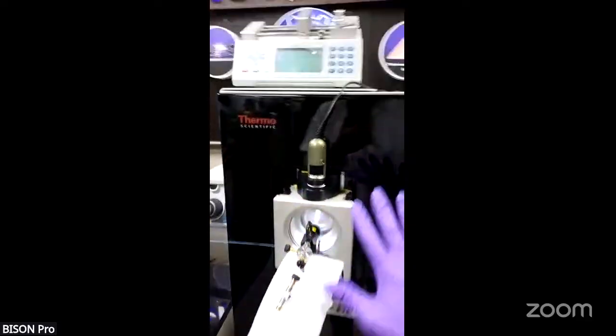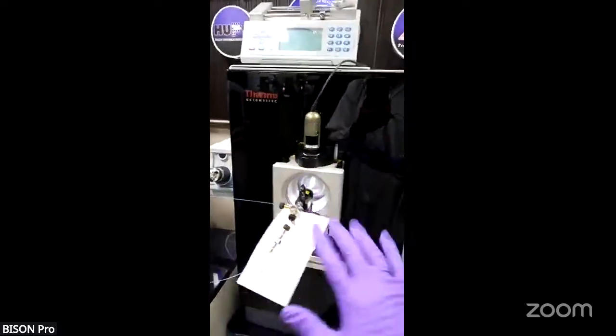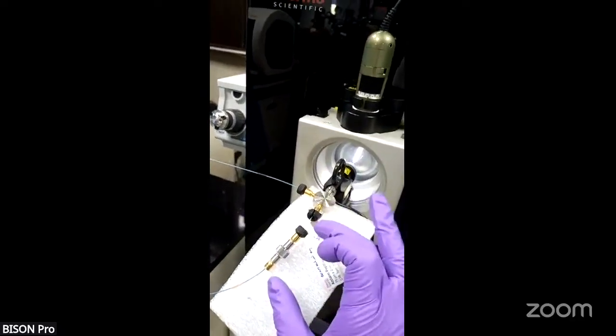This is basically the ion source of the Orbitrap. This is a nano LC ESI spray ion source. You can see the pre-column. This part is the pre-column.